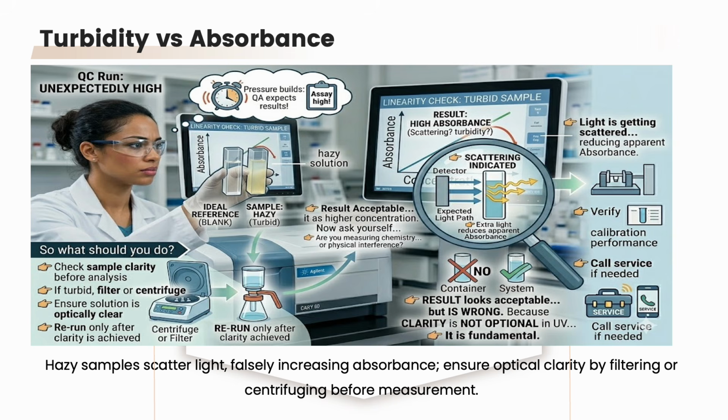So what should you do? Check sample clarity before analysis. If turbid, filter or centrifuge. Ensure solution is optically clear. Rerun only after the clarity is achieved, because clarity is not an option in UV, it is a fundamental.